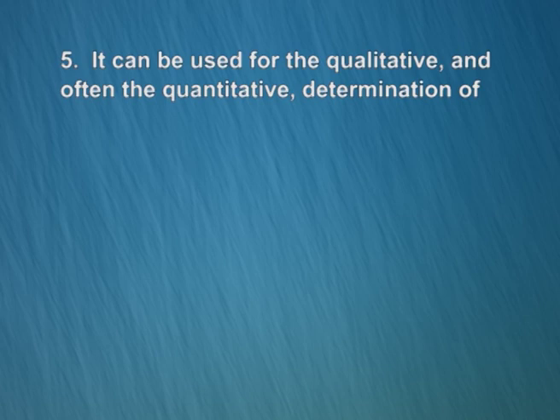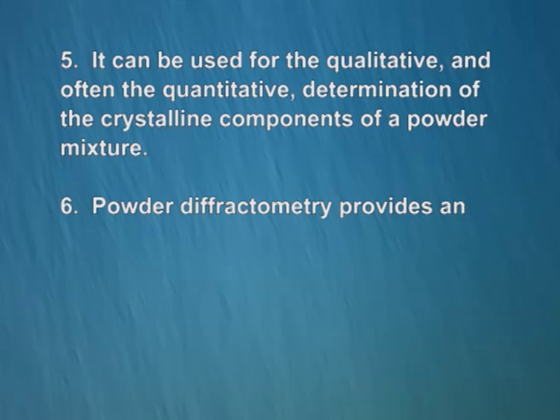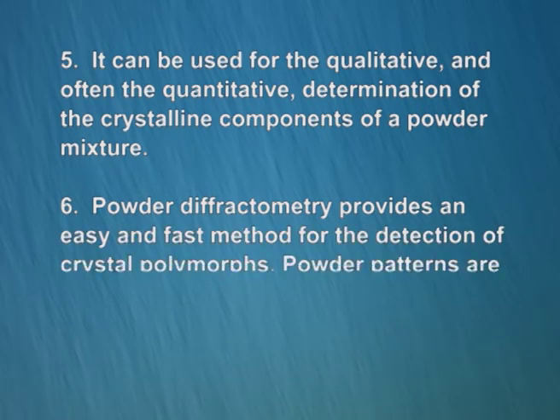5th, it can be used for the qualitative and often the quantitative determination of the crystalline components of a powder mixture. 6th, powder diffractometry provides an easy and fast method for the detection of crystal polymorphs.